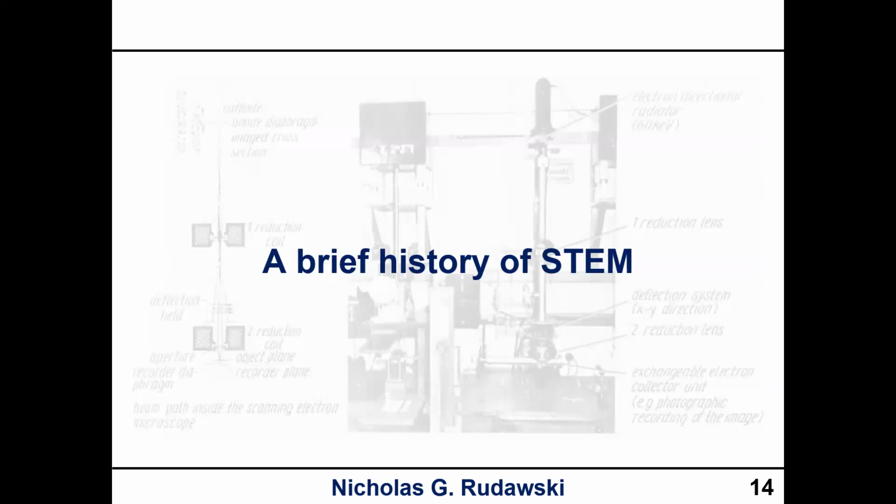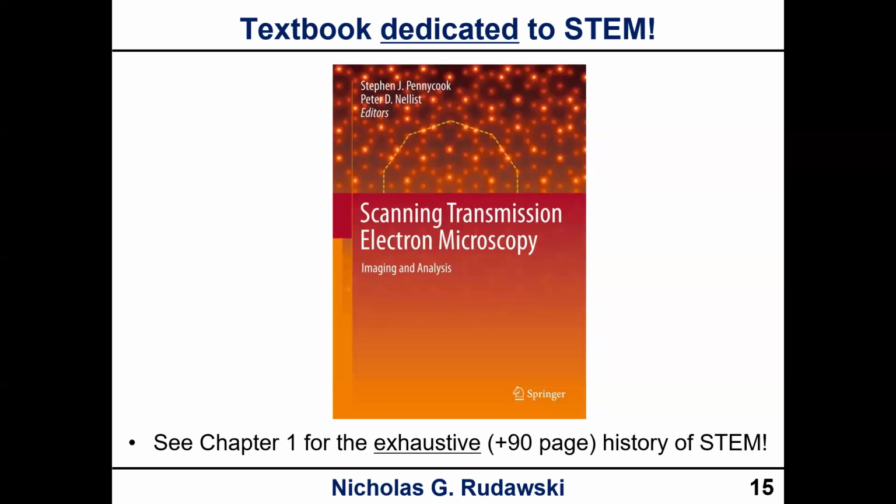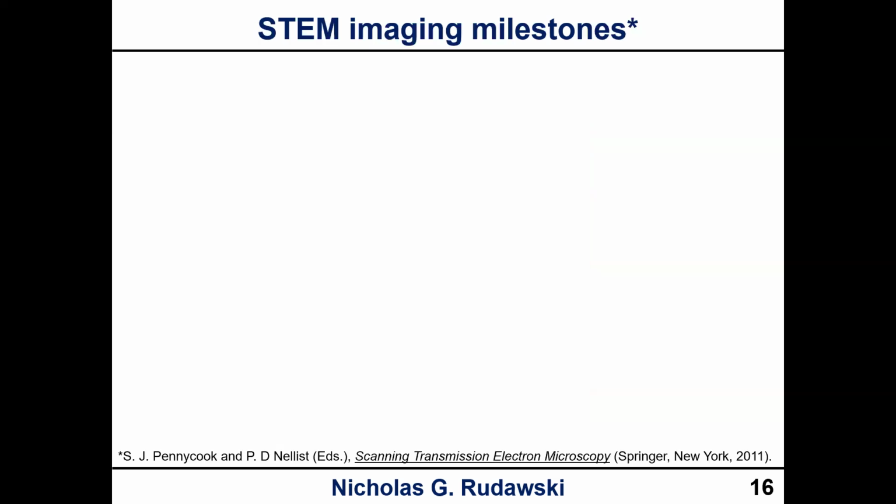All right, so now we're going to go over a brief history of STEM. And I want to give credit where credit is due. There's a great textbook that's actually dedicated to STEM. I don't believe that there has been a second edition of this come out yet. This is from, I believe, 2011, so it's actually 13 years old, but it is dedicated to STEM. It talks about theory, talks about applications. It is great. And chapter 1 is an exhaustive 90-plus page history of STEM. So I highly encourage you to check this out if you want more than just the cliff notes I'm going to give you here.